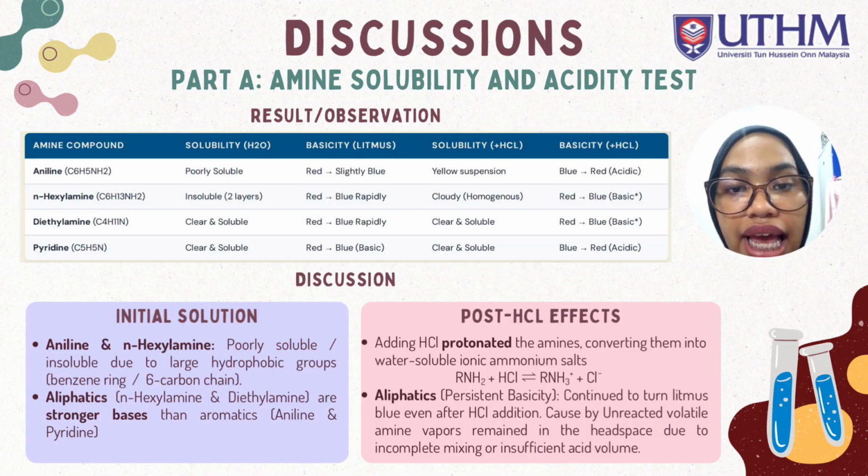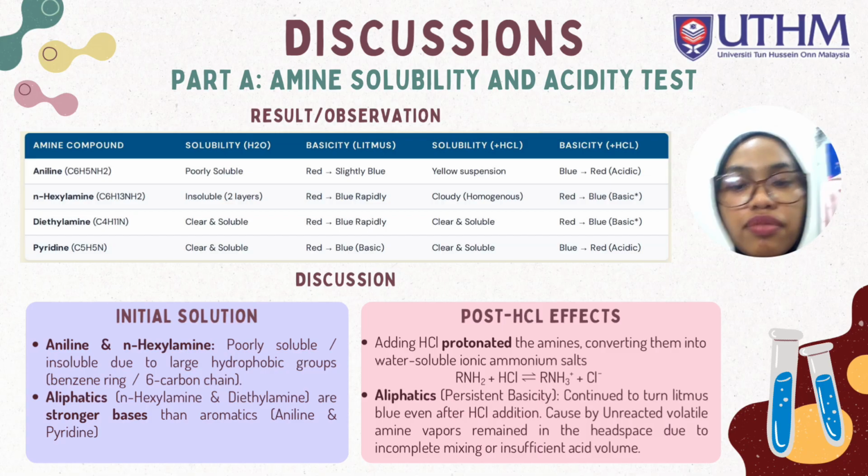Post-HCl effects: adding HCl protonated the amines, converting them into water-soluble ionic ammonium salts. For aliphatics, persistent basicity continues to turn litmus blue even after HCl addition, because unreacted volatile amine vapor remains in the headspace due to incomplete mixing or insufficient acid volume.